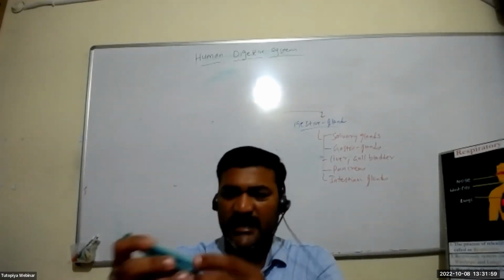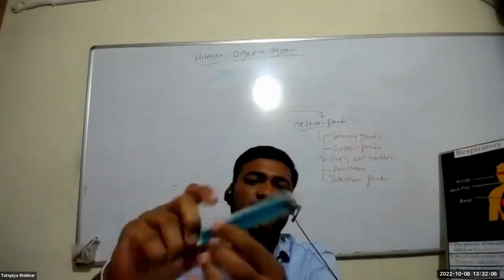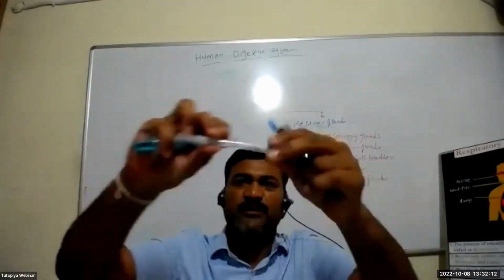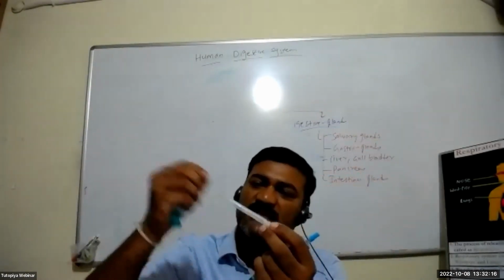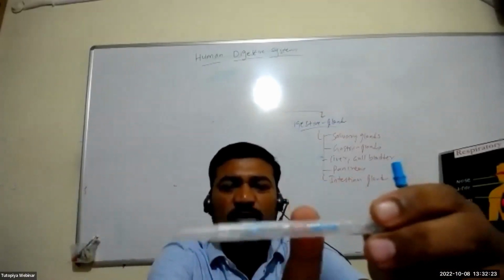Now, see, I have a syringe here. This is a 100 ml syringe, and I have taken another syringe. So there are two syringes here, and I'm connecting these two syringes by a glass tube. I've just taken a pen. It's a glass tube, and inside this glass tube, I'll insert some copper wire. Just take some fine copper wire and insert it with some small needle until the middle of this tube.